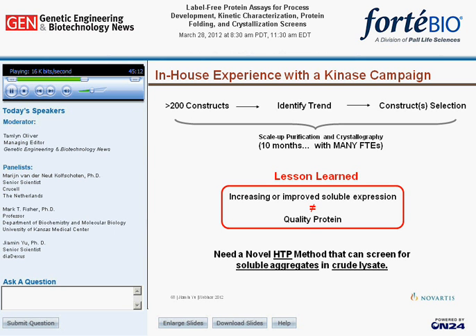And the valuable lesson we learned was that improving soluble expression was not equivalent to having access to quality protein, since you can have soluble aggregate. At that time, in 2006, most published literature was describing high-throughput methods designed to screen for improved soluble expression only. There were also papers describing biophysical methods to look for quality protein. Again, these methods typically require a large amount of clean protein, which means it's not truly high throughput.